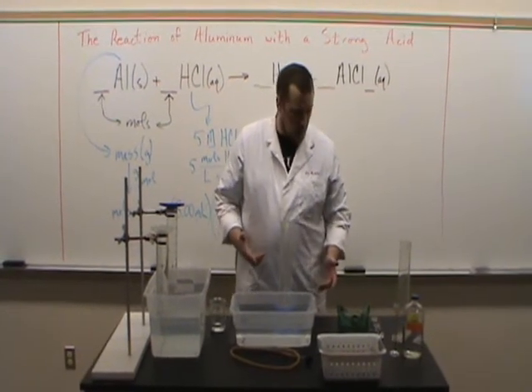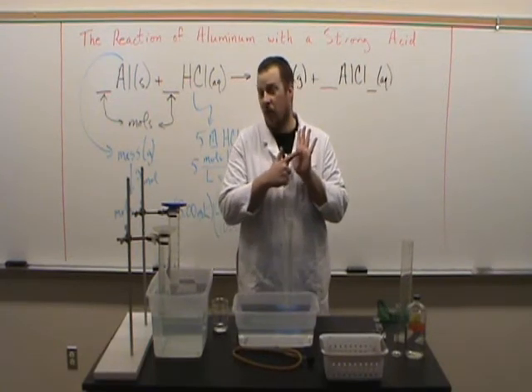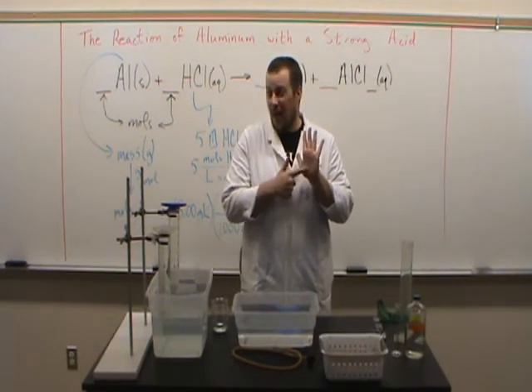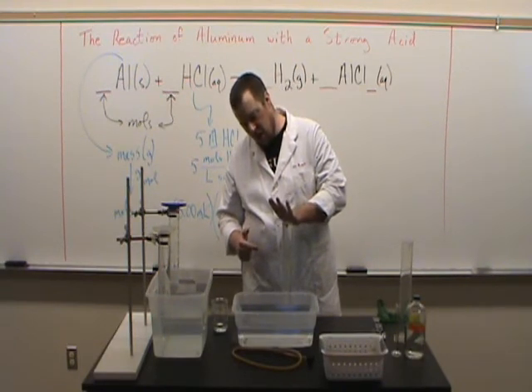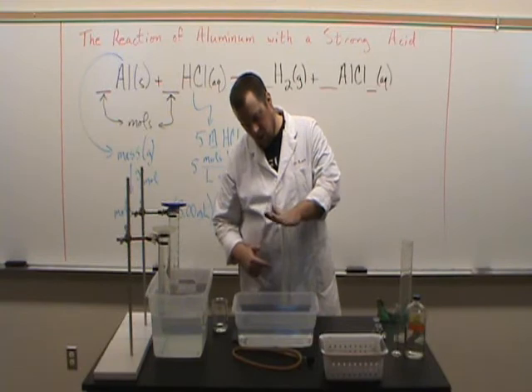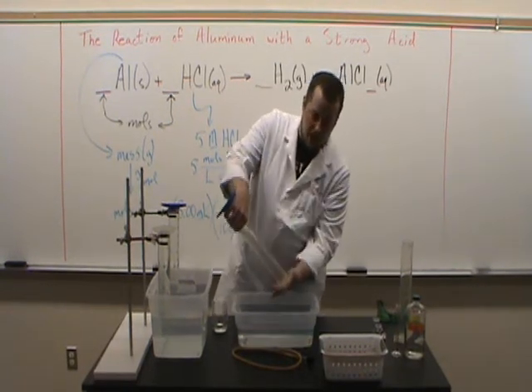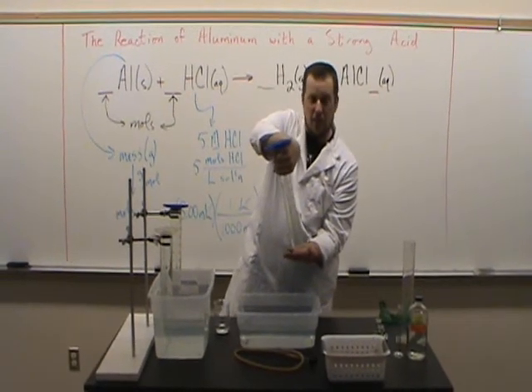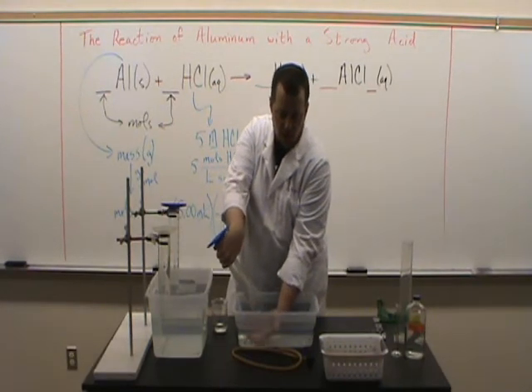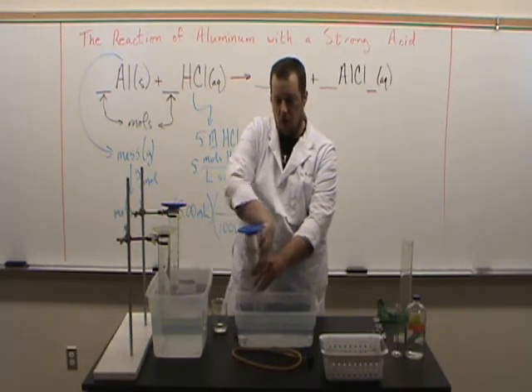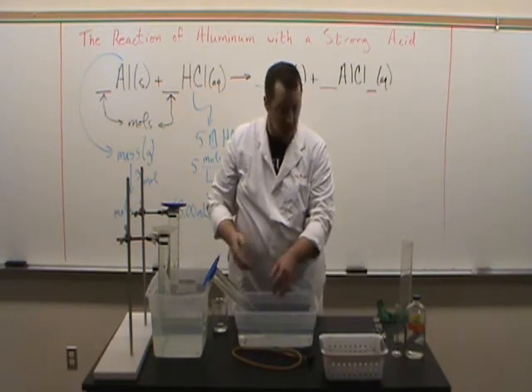Why do we want to do that? Well, because now, if you take something that's about the same size as the top of the graduated cylinder, and you very carefully put it over the top, I can turn this upside down, and it's still full of water. I've got no air bubbles in there, and if I put this under the surface of the water before I release it, it stays full of water. So there's our setup.